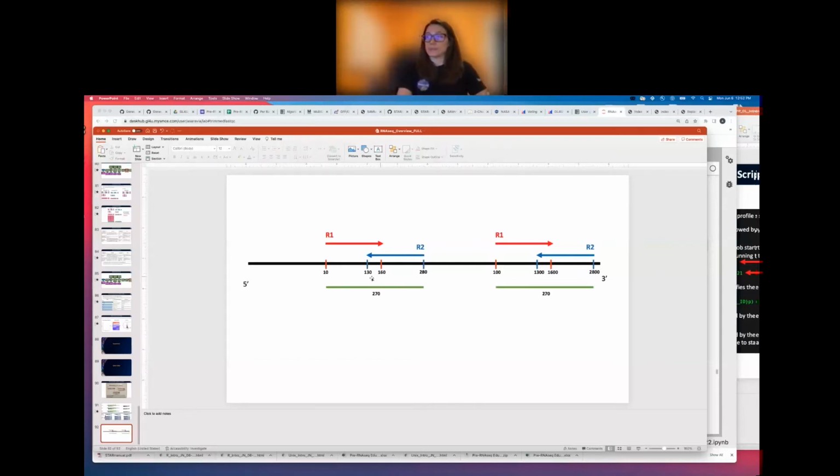So now in this example, these mate pairs, right? Again, the same exact mate pairs. We see that the forward read aligns to this location on the reference genome, but it also aligns to this location on the reference genome. Again, because there's similarity in those two locations on the reference genome in the sequences. And we also see that this reverse read maps to 2 different locations on the genome. And so again, the forward and reverse go together.